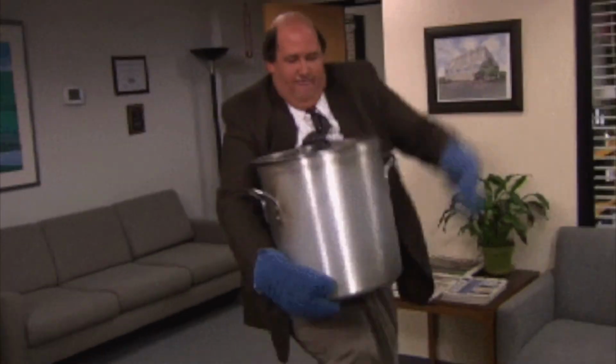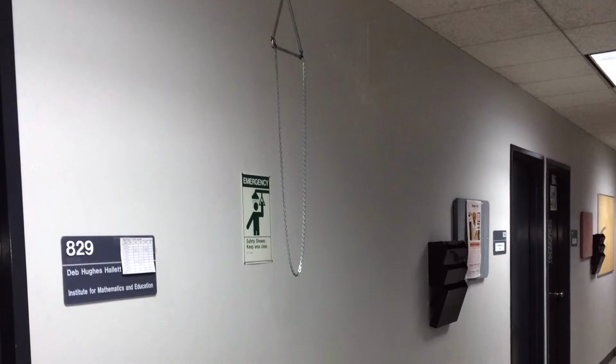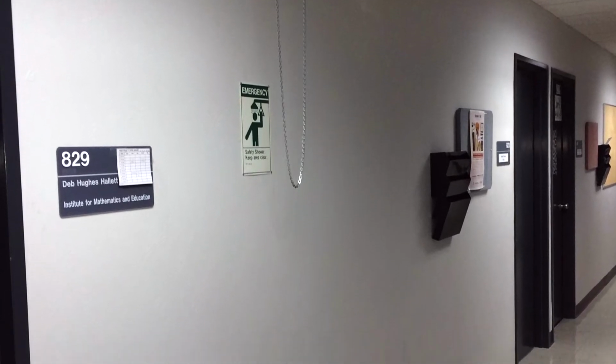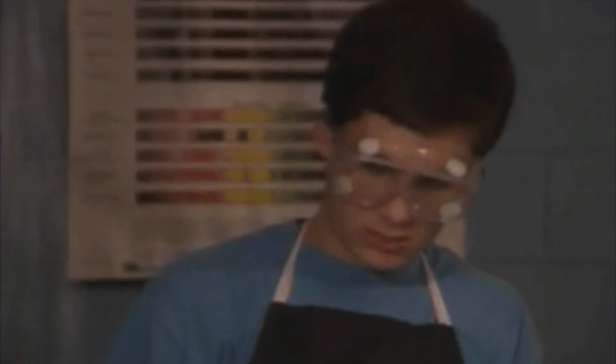If you somehow manage to douse yourself with large quantities of these dangerous chemicals, then it would be best to use the safety shower, located outside the laboratory in the hallway. Your classmates should assist you in removing the affected clothing. Just don't be like this bloke and stare directly at your half-naked classmate as they wash.